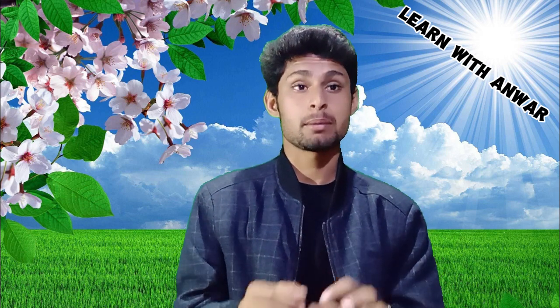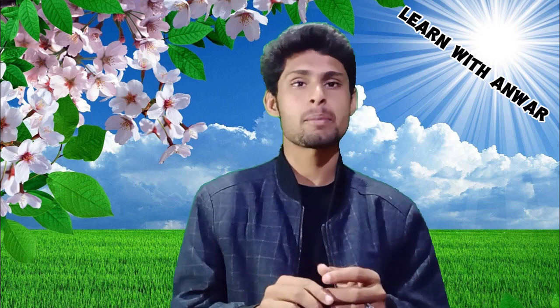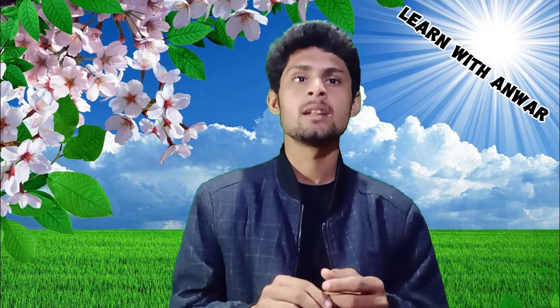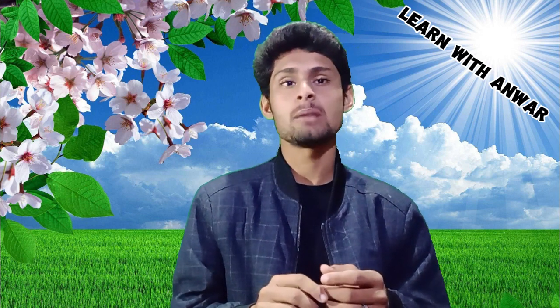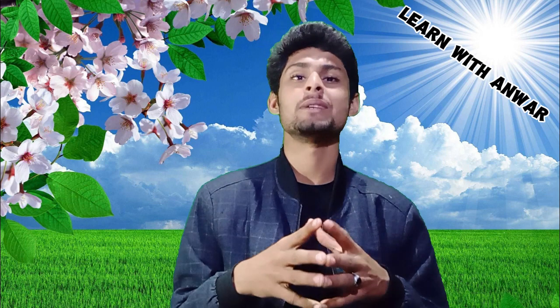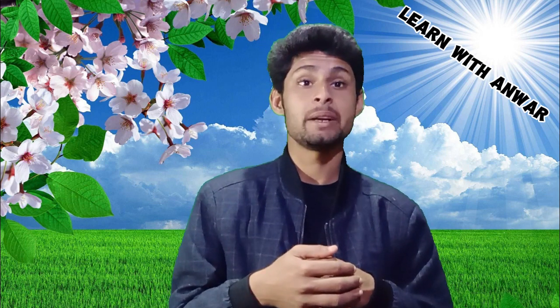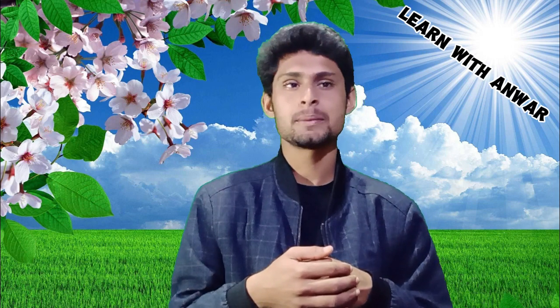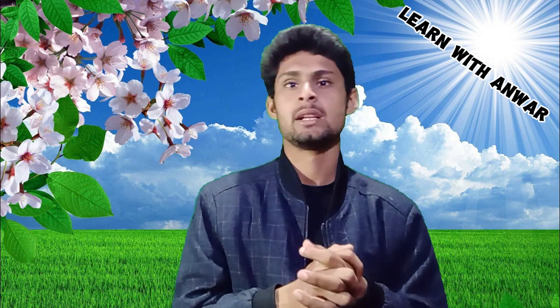Single-lens simple microscopes can magnify up to 300 times and are capable of revealing bacteria, while compound microscopes can magnify up to 2000 times. A simple microscope can resolve below 1 micrometer, one millionth of a meter. A compound microscope can resolve down to about 0.2 micrometer.